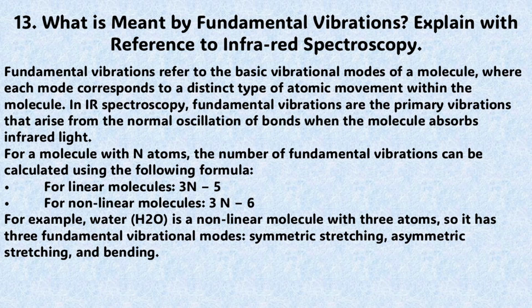Fundamental vibrations. Thus, vibrations refer to the basic vibrational modes of a molecule, where each mode corresponds to a distinct type of atomic movement within the molecule. In infrared spectroscopy, fundamental vibrations are the primary vibrations that arise from the normal oscillation of bonds when the molecule absorbs infrared light. For a molecule with N atoms, the number of fundamental vibrations can be calculated using the following formula.